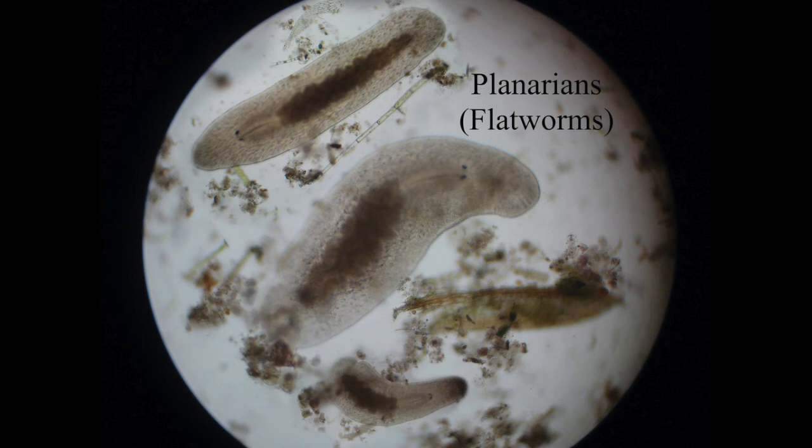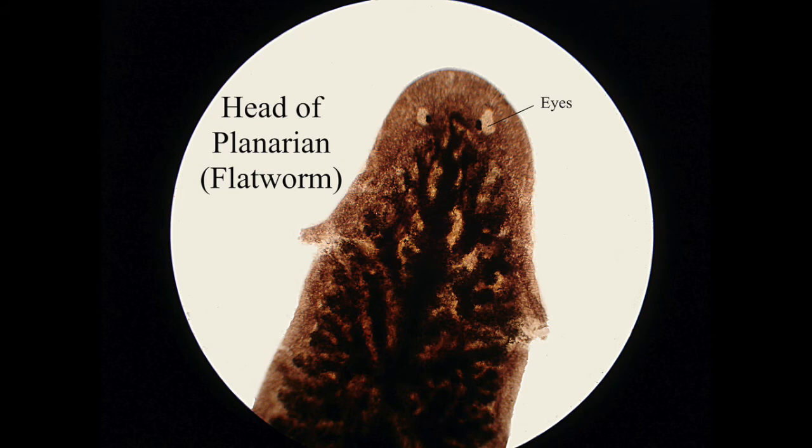Moving on to planarians — these are sometimes called flatworms or flukes. They're obviously very flat and when they move they kind of glide across the surface; they don't wriggle around like a true worm would. You can very clearly see the couple of small eyes on the top, and when you're looking at them under a microscope they have this kind of cute look to them. This is just a close-up of the head of one showing their eyes.